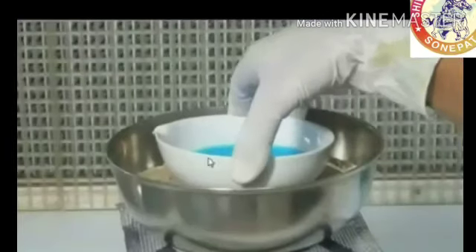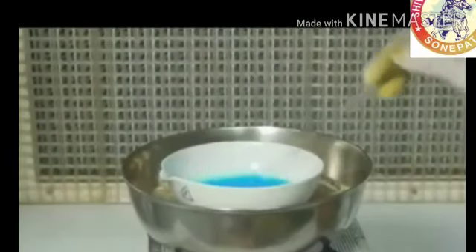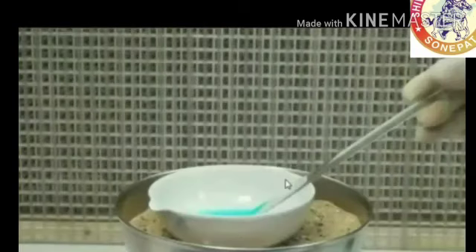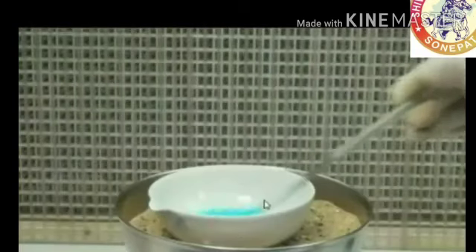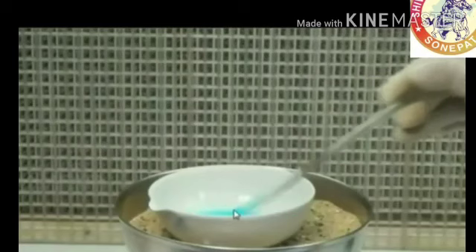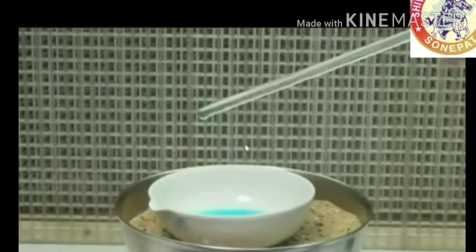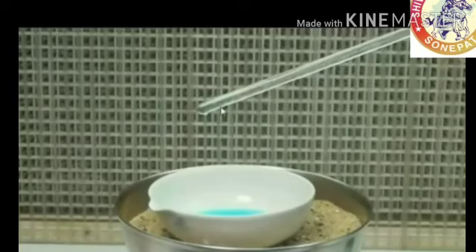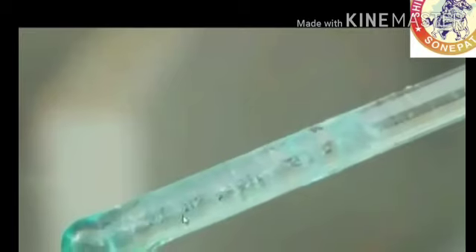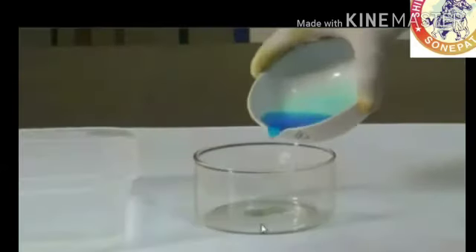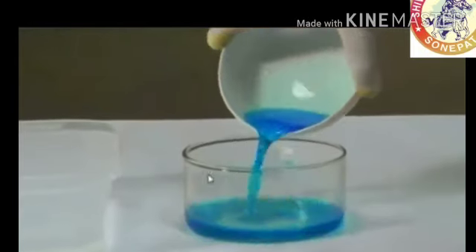In the filter paper, all the insoluble impurities get collected. Now, put the china dish on the sand bath so that we can heat this solution slowly by constant stirring with a glass rod. After some time, we get some solid substance on the glass rod. This temperature is known as the crystallization temperature.